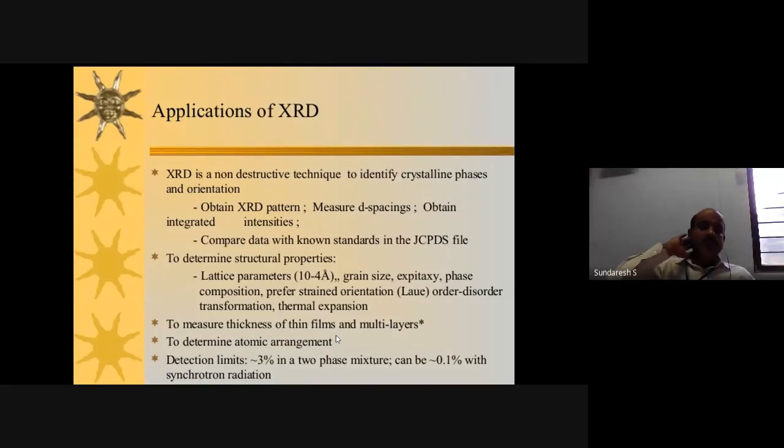In this sense, they obtain the XRD pattern and measure these spacings. This spacing is the distance between the atomic planes, and it gives integrated intensities.